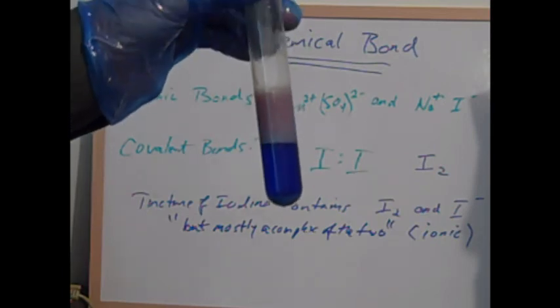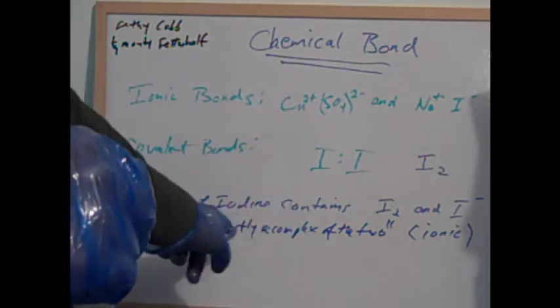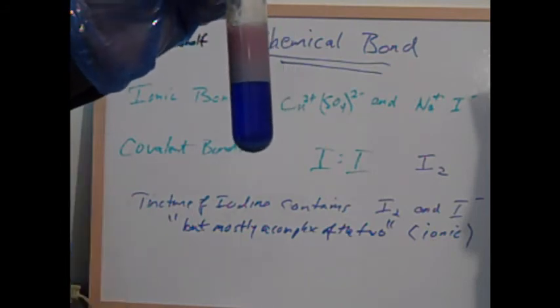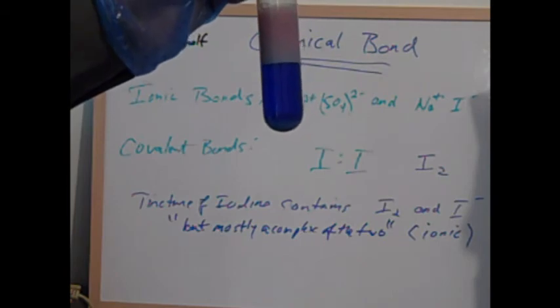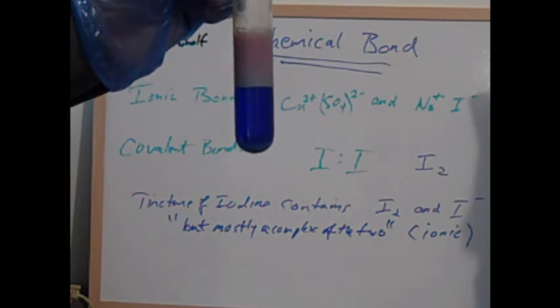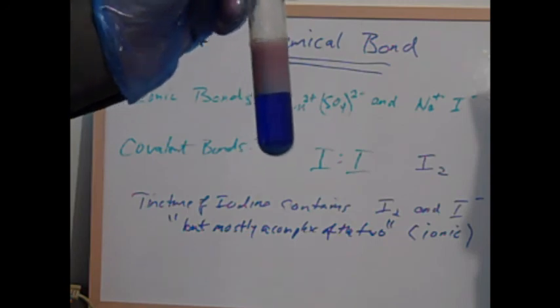And because the copper is no longer available to oxidize this iodine-iodide complex, the iodine-iodide complex reforms and dissolves back in the copper sulfate solution, back into the water solution. There's no longer any available to dissolve in the mineral oil, so it loses a lot of its purple color. Okay, I hope you learned something from that.